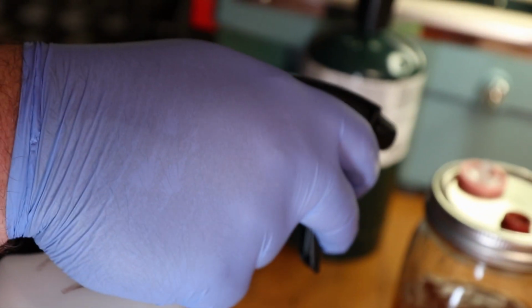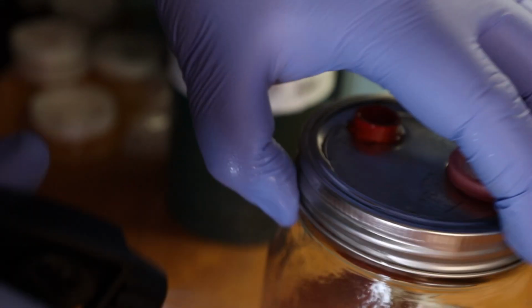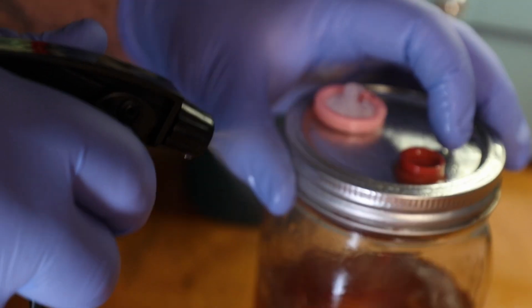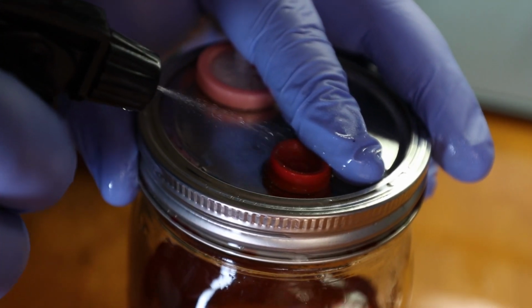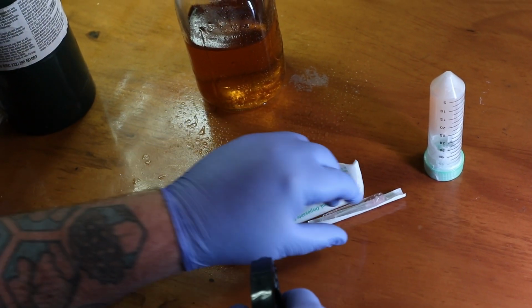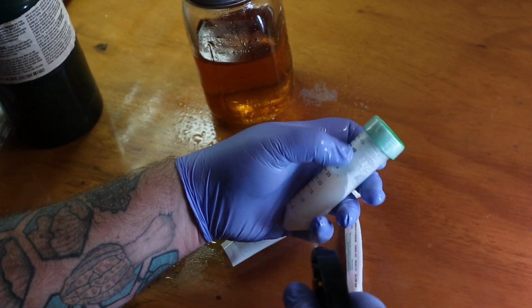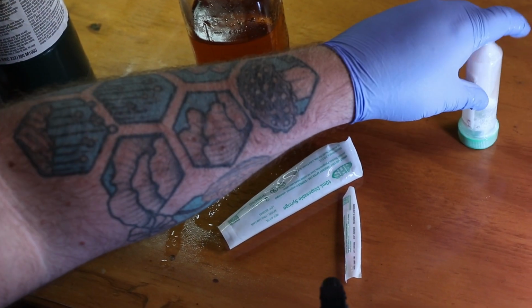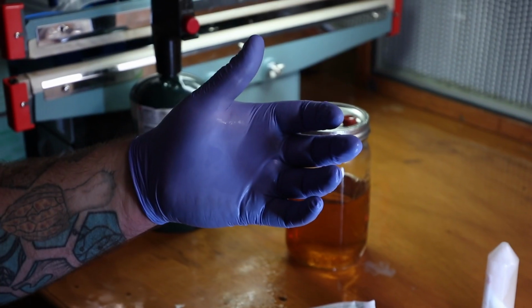You're going to then take your alcohol and alcohol down your lid. This is just to sanitize a jar that may have been sitting out for a little while. I like to lubricate and clean the injection port to help the needle slide through. I then like to alcohol down the packaging. We leave our boxes on the lab open, and so it just helps me get any dust or anything that's settled, plus cleaning or sanitizing the culture before we open it.